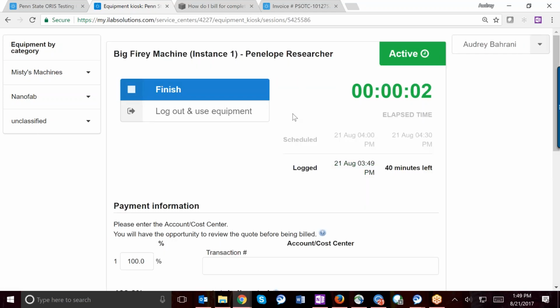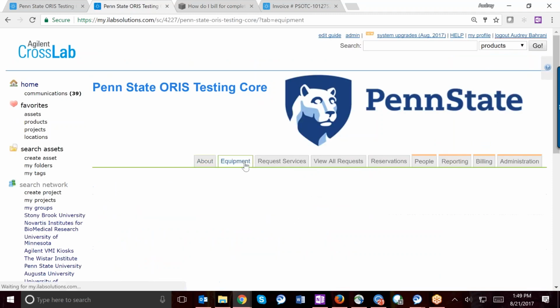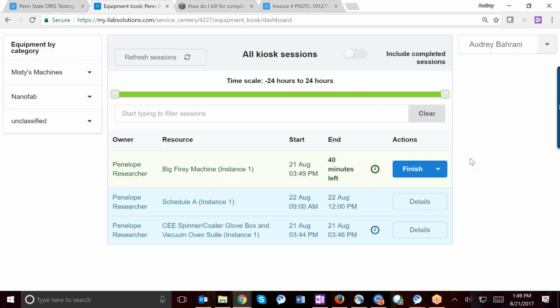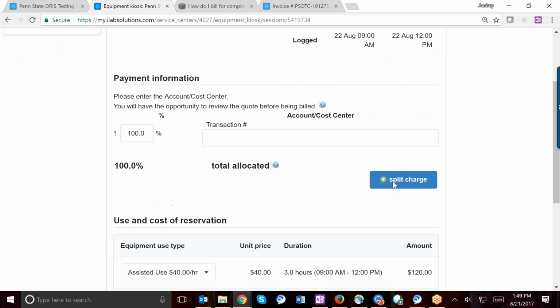It's really similar. We'll click start. It takes us to that reservation detail screen and we'll see it does go ahead and start the time for us. If it is in the future, but not within that 30-minute window, which we've said they can start it early, they're still going to see their session coming up, but they're going to have a detail screen instead. They can't actually take action to start that particular session yet.